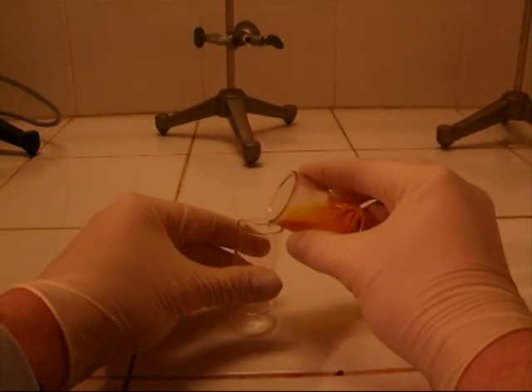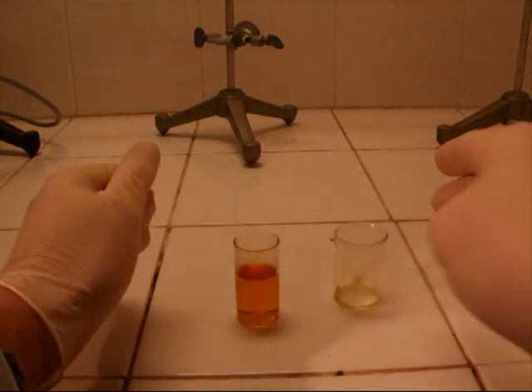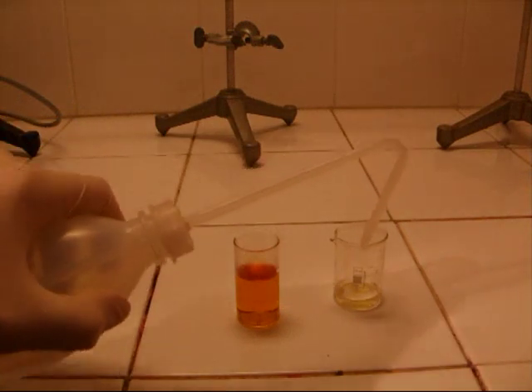To stop the reaction, I separate the aqua regia from the rest of the gold. To stop further reactions of the gold with the rest of the aqua regia, I pour some water onto the gold.